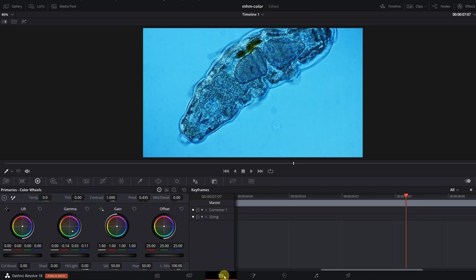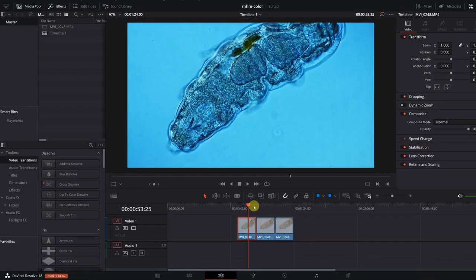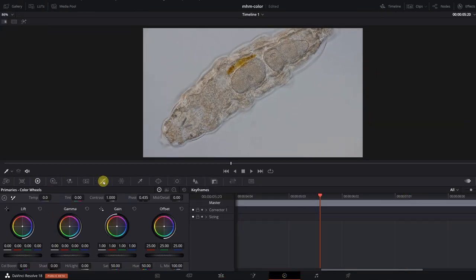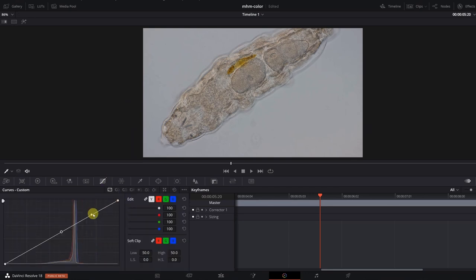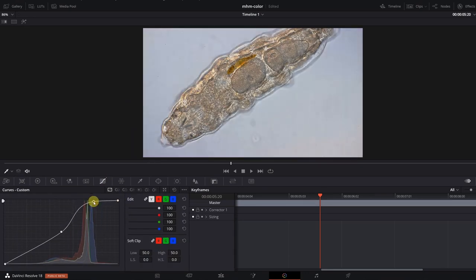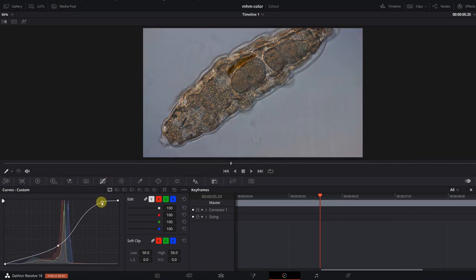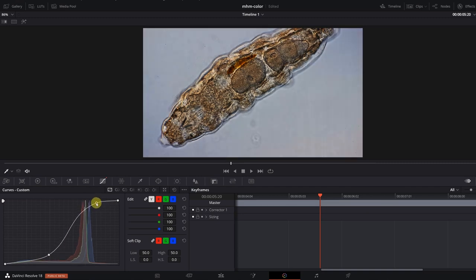Let's move back again. Now I'm going to go into the next clip. I've got the same clip of the tardigrade three times. I'm going to again adjust the contrast here a little bit, so I'm going to make the bright areas brighter and the dark areas darker. Don't overdo it, but I think this is going to be fine now.